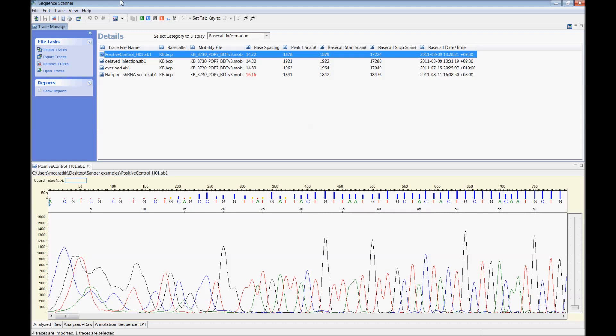For troubleshooting the Sanger reads we'll be using the software Sequence Scanner. Check out our other videos to see a quick run through on how to use the software.